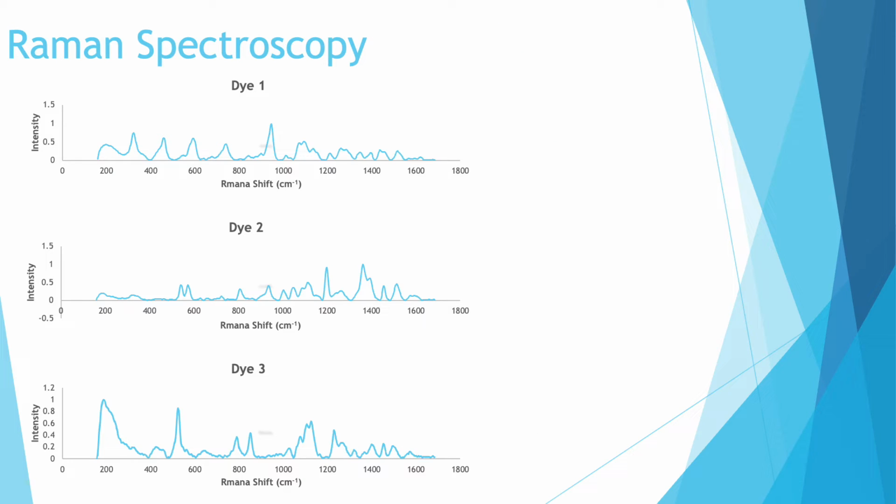An emerging type of imaging that I spent my time on the last 6 months is Raman spectroscopy. Similar to bioluminescence, Raman uses visible light. More specifically, how Raman spectroscopy actually works is that the bonds of a molecule are constantly vibrating inside, and when you shine a laser on them, the photons from the light are going to hit that molecule and scatter at different frequencies, depending on what that bond is. So some of the scatter is filtered out, and what you're going to be left with is the Raman scatter.